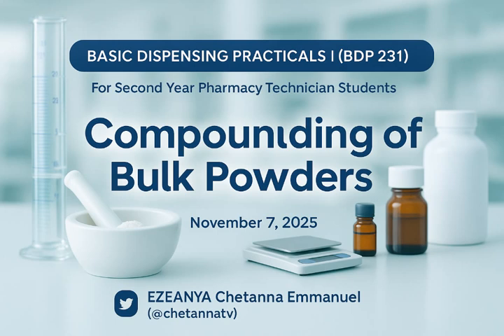50 grams. Yes. You have reduced this formula, and proportionally you get the actual ingredient you need to get 50 grams of the powder. Is that clear? Are we good? Yes. But there is something I want to point out, and it's very important.